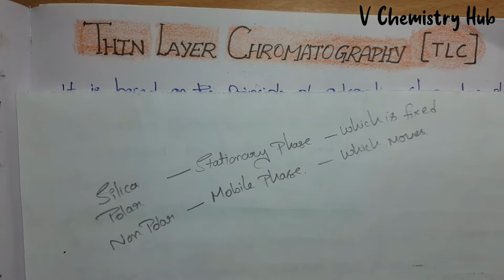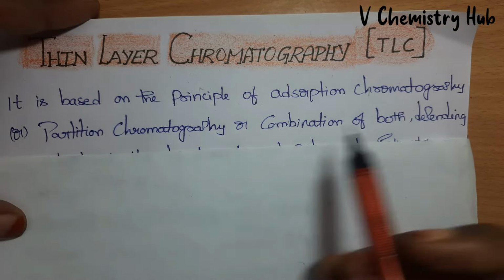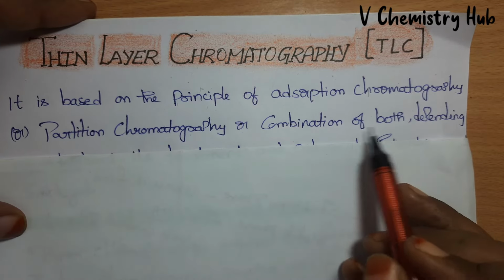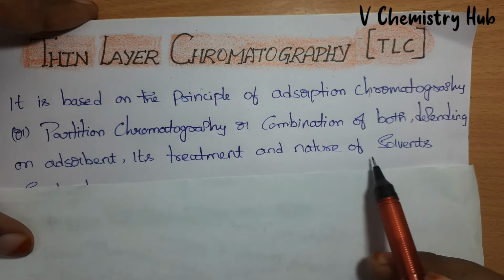Now coming to thin layer chromatography. It is based on the principle of adsorption chromatography, or partition chromatography, or the combination of both adsorption and partition. So it depends on the adsorbent, its treatments and the nature of the solvent.